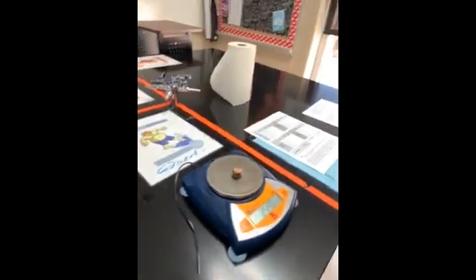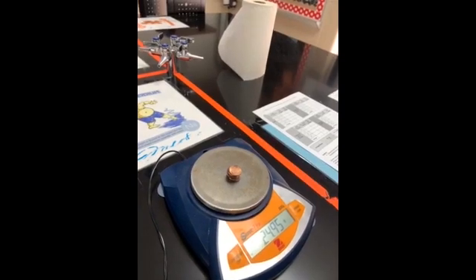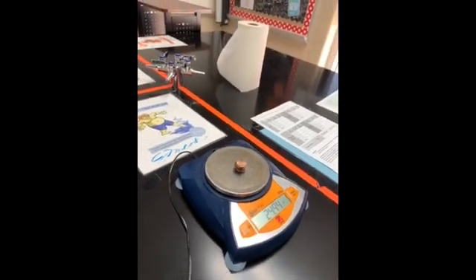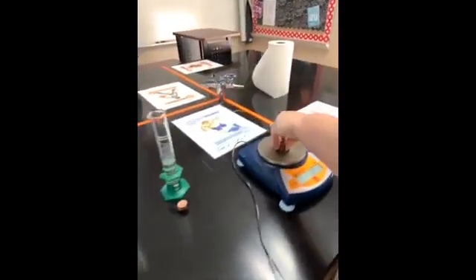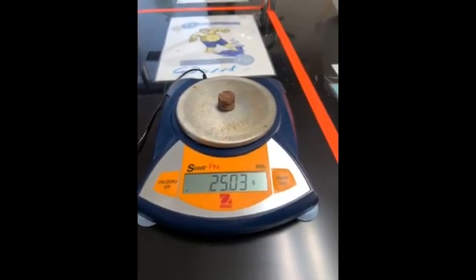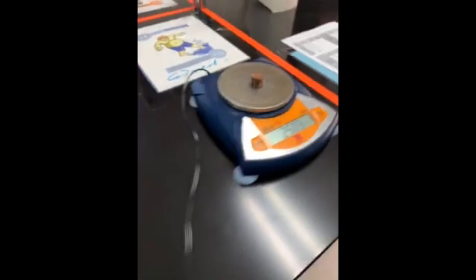All right, trial 2, post-82 pennies. Again, go ahead and write that down for your mass of the post-82 pennies. That last digit may not stay still. Trial 3 of the post-82 pennies. Go ahead and get that written down.